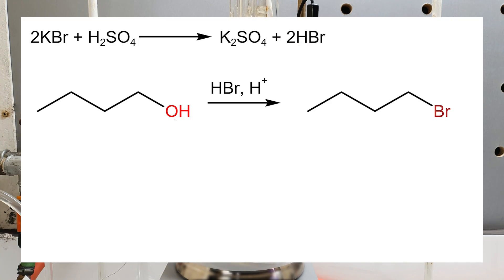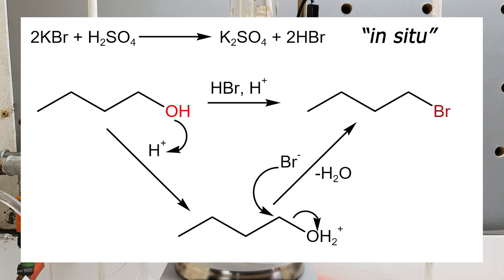Here is the reaction going on: we generated hydrobromic acid by adding sulfuric acid to potassium bromide. This method of preparation is called in situ. Instead of wasting time to prepare and purify the hydrobromic acid separately — which normally would take several hours — we achieve the same result by mixing the reagents beforehand. We then added butanol, which reacts with the acid to form bromobutane. The reaction proceeds efficiently only when the pH is very low, so that's why I added a second portion of sulfuric acid. The reaction mechanism involves formation of an oxonium cation, which requires very harsh acidic conditions. The oxonium group is a very good leaving group, and when bromide attacks the carbon closest to it, it is substituted and water is released, forming the bromoalkane.